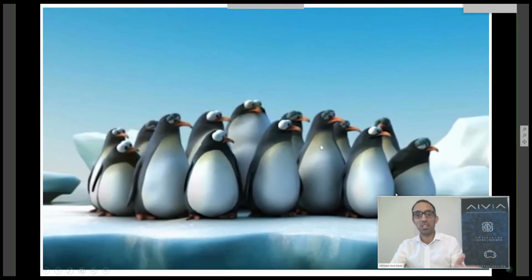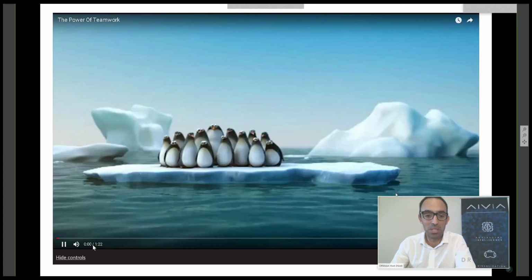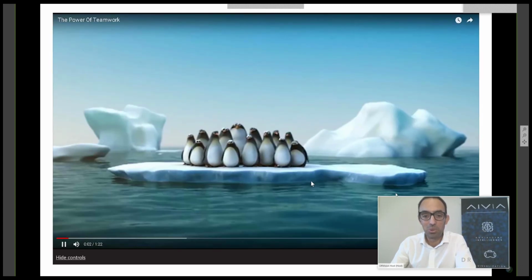So if you go now into the second or the last part, which is using the visualization but going one step beyond that, it's about creating animations from this visualization, how to create those, and what we can propose as good rules or good tips to use when creating one. So before we get into this, I'd like to show you this brief video. It's a minute. I find it really cool.